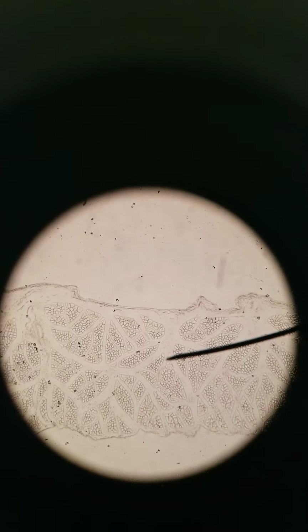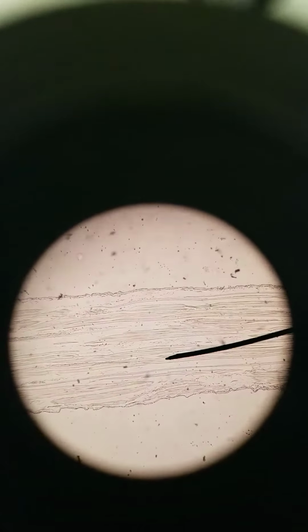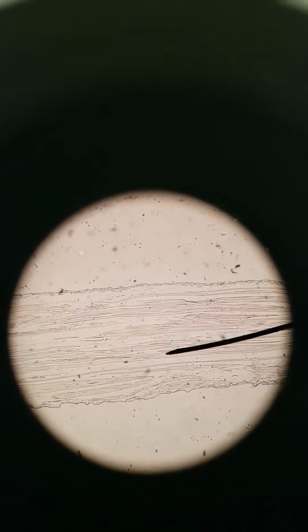We were just looking at skeletal muscle in cross-section. That's what you see right here in 40x magnification. We can also look at skeletal muscle in longitudinal section. Now, once again, this particular slide doesn't show the staining that well, so I'm going to switch to a different slide. And actually, the staining is better, but you don't see what I want you to see.